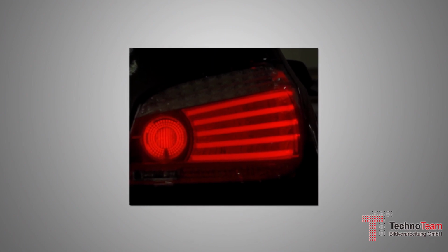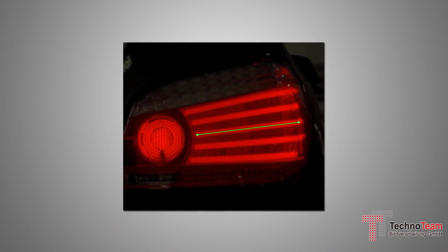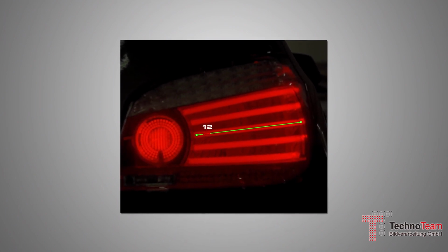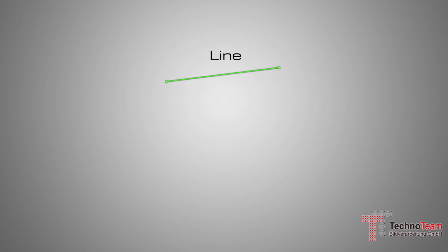Sectional view is the second statistic in the statistic type menu. The key role of this statistical analysis is to represent the brightness profile along a line. Sectional view is usually carried out with the help of a line measuring region.